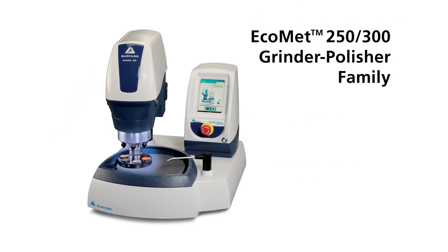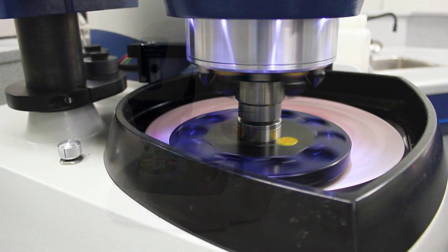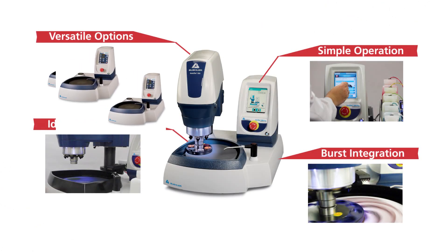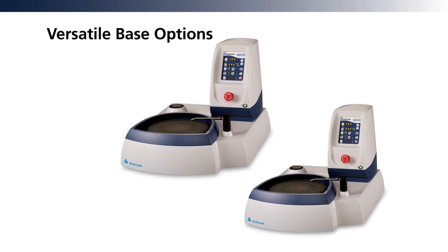The EcoMet 250/300 grinder polisher family — versatility and durability for specimen preparation. Versatile enough to handle manual preparation, high-throughput applications, and any combination in between.